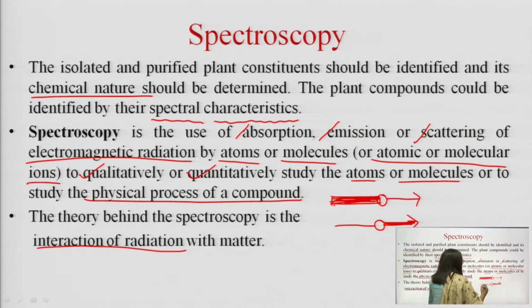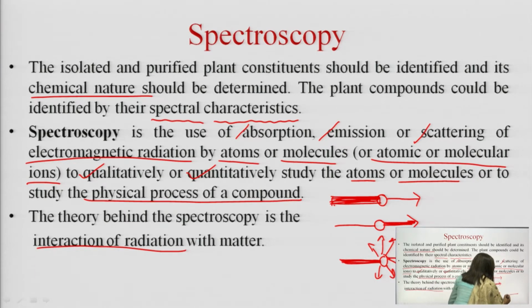In case of scattering, there are two incidences where the electromagnetic radiation entering the sample would emit either outward scattering of the light or inward scattering of the light.